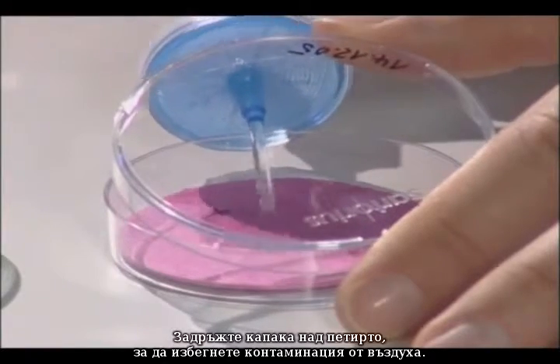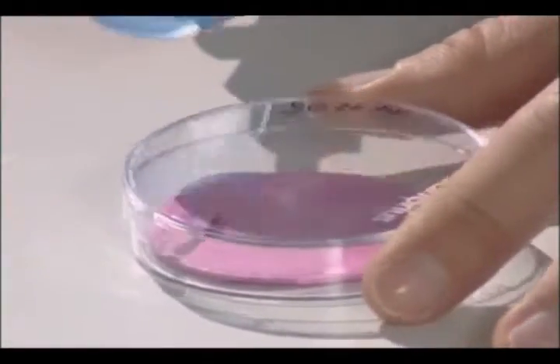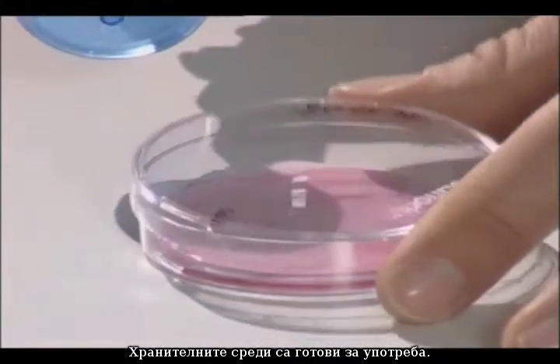Pump the trigger repeatedly to fill the syringe filter and wet the nutrient pads with sterile water. Hold the cover over the petri dish to protect it against airborne contamination. The nutrient pads are now ready to use.